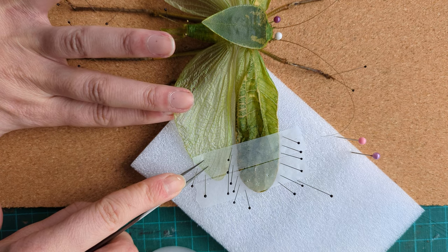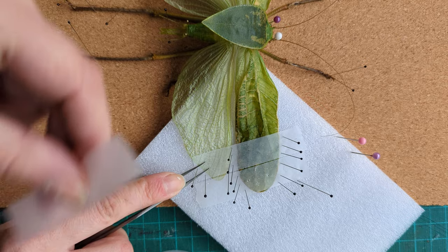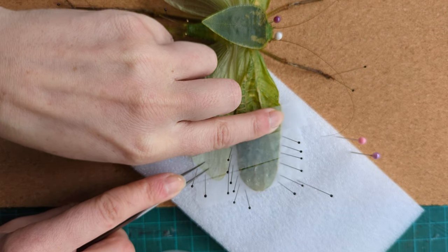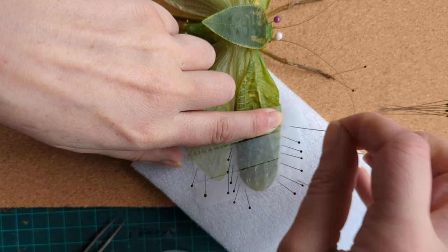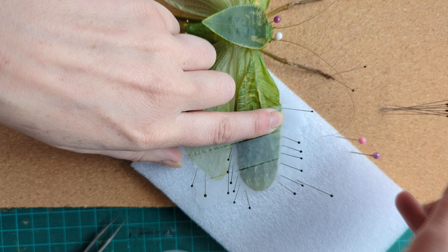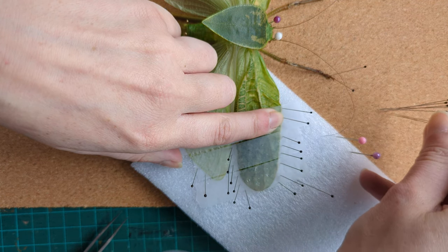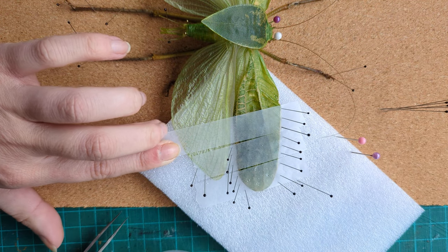When you're handling these, the wings are incredibly fragile — probably only second to dragonflies, which are my arch nemesis to pin. Just be very cautious when you're going in with a second wing as they are very flimsy with no structure or robustness to them whatsoever. They do need some real encouragement to be held flat.